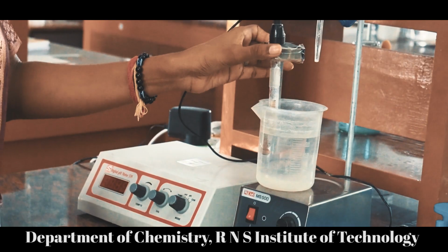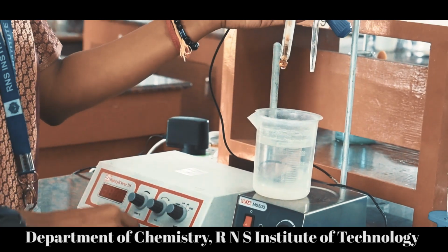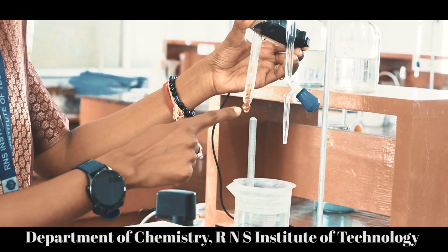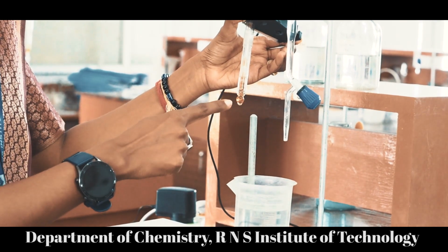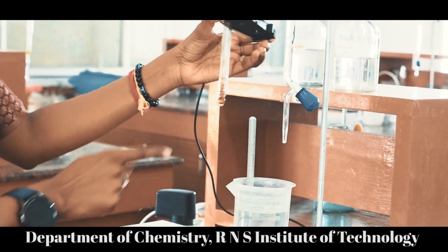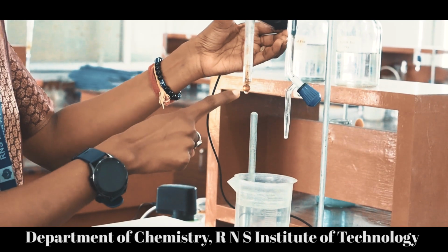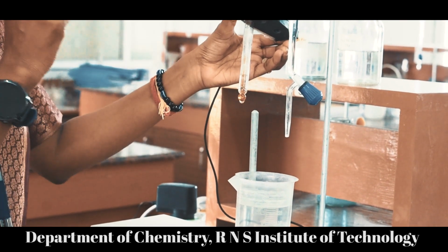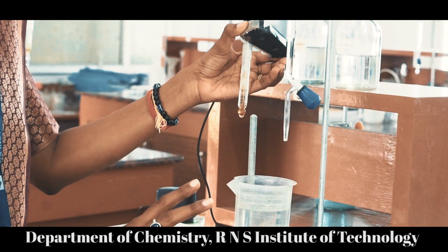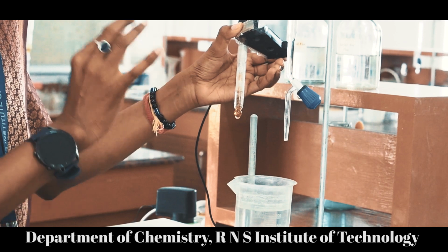Now, we'll see the electrode which we use in the experiment. This is a glass membrane electrode, and we can observe a glass tube and a glass membrane in the form of a glass bulb. This glass bulb senses the concentration of H+ ions and gives the pH value through the digital pH meter. While using this electrode, you have to be very careful, as the glass membrane is very thin and fragile and may break any time. Even if it breaks, it doesn't produce a sound. So you have to use it carefully.